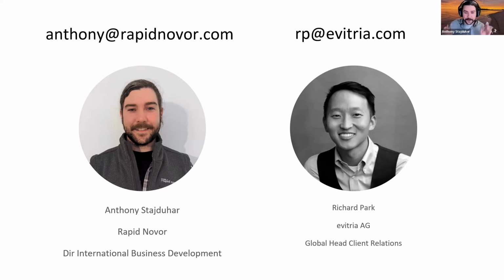I don't want to generalize and say that we've got this thing nailed down, right? Because it's biology and things are always different. But I would say that's probably one of the more interesting and surprising things: that number, that antigen specificity, can really vary a lot depending on the antigen, the animal, the age, the circumstances of the immunization, the bleeds, so much that can run into that, because it's such a dynamic system. So yeah, that's probably one of the more interesting things that I would say.